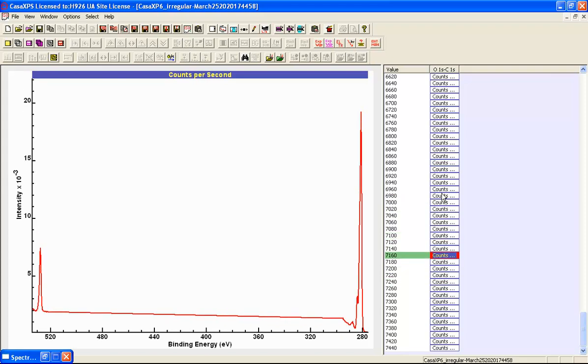So what we need to do is identify a pair of these spectra that would be representative of the interface between these two. So we can see an example where we've got something that has a significant proportion of polystyrene and then another one that has a significant proportion of the PVP. And then we can use the spectrum processing dialog window on the calculated property page to look at different spectra.